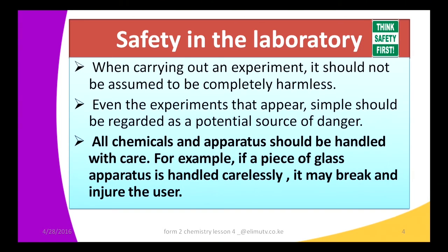Right. So from the demonstration we've just had, you note that the emphasis is the same: safety. Just to highlight some of the things you have just seen: in the laboratory you're not supposed to run, and you've seen what can happen if you run in the lab. Equally, in the lab you're not supposed to eat or drink because some of the chemicals used in the laboratory are dangerous, they may harm us. We're also not supposed to just put on any attire in the laboratory. There are specific attires that you're supposed to wear in the laboratory for your own safety. So the demonstrations are emphasizing safety in the lab.